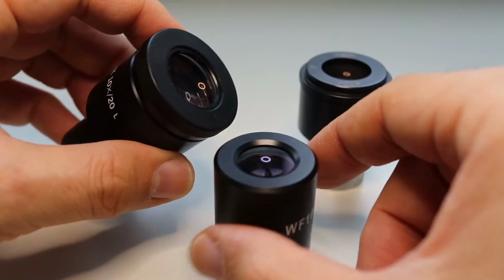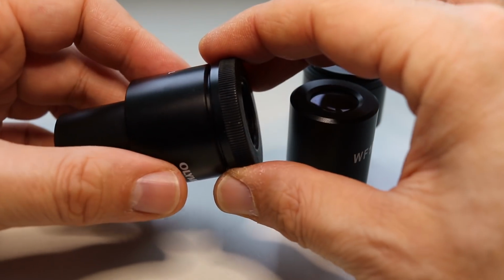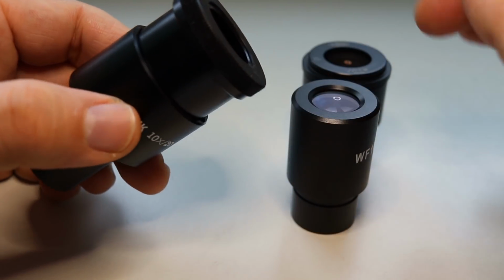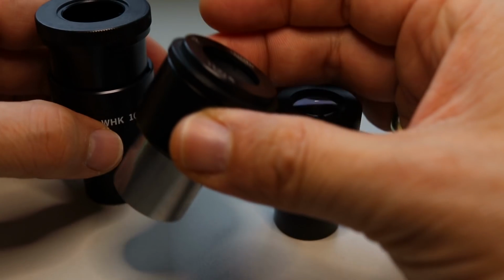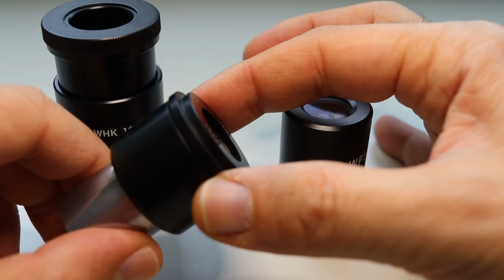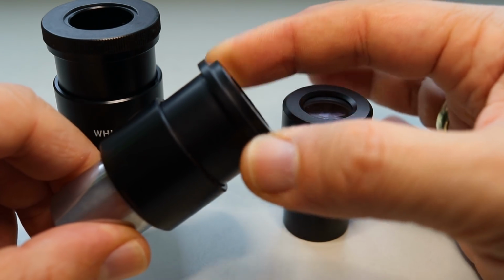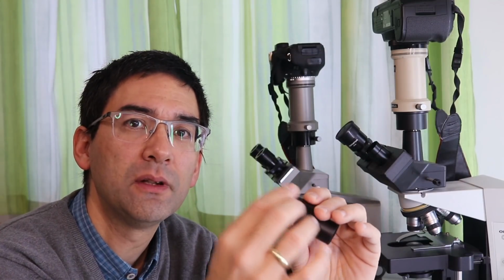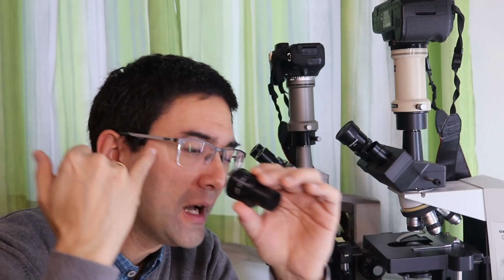But what you're pulling out here is really not a lens. There are no lenses here. It's simply an empty, hollow barrel, and what this does is the following. These are eyepieces with a so-called long eye relief. Now, what is the eye relief? The eye relief is the distance that you have to have between your eye and the eyepiece.